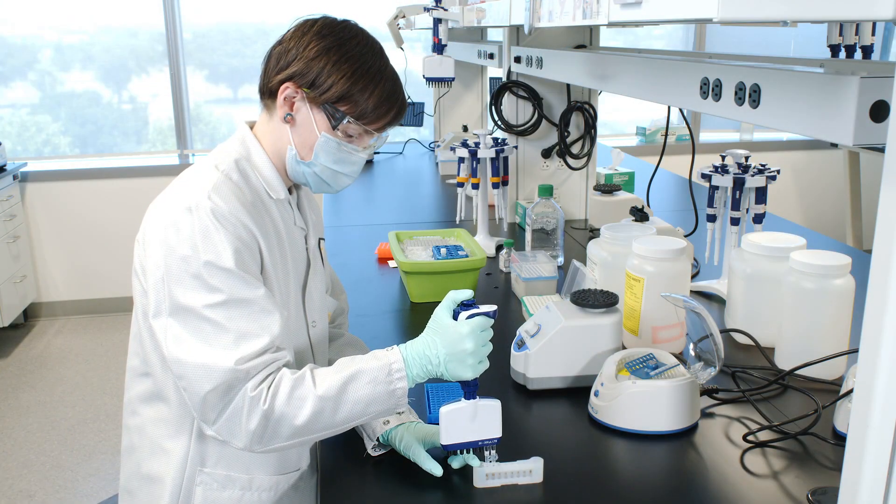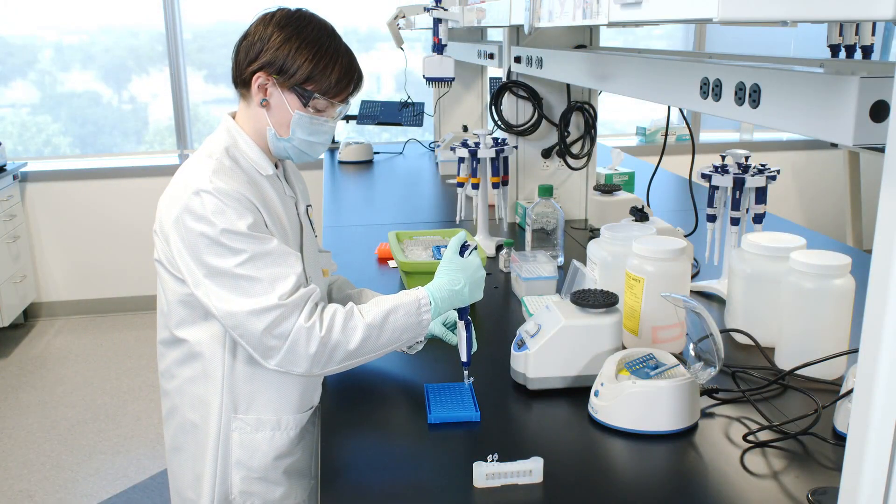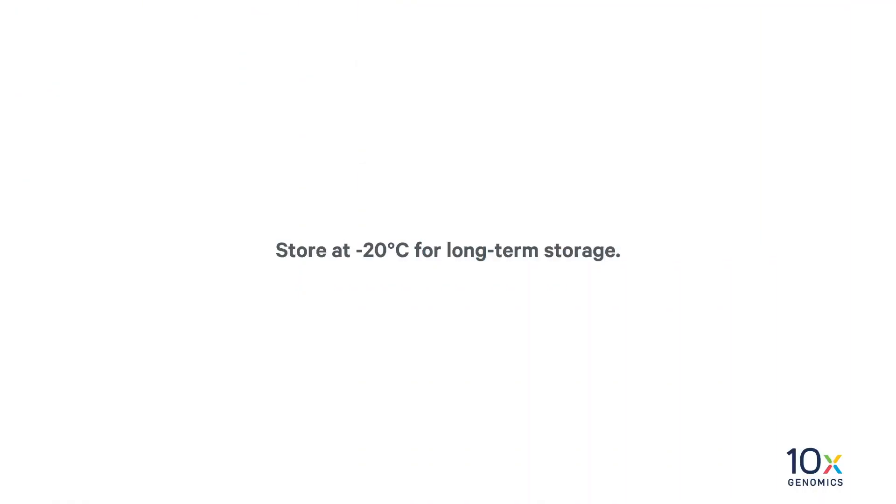Transfer 25 microliters of sample to a new tube strip. Store at -20°C for long-term storage. We have completed sample index PCR and SPRI select cleanup. Refer to the user guide for post-library construction QC steps.